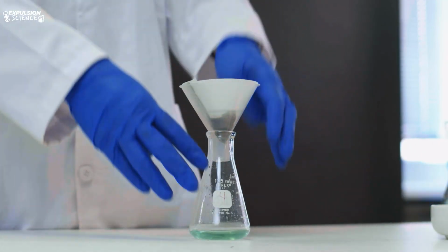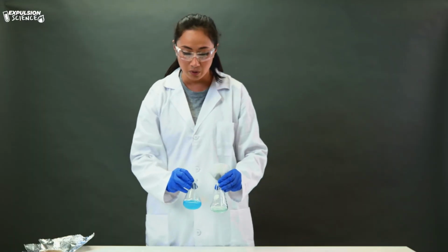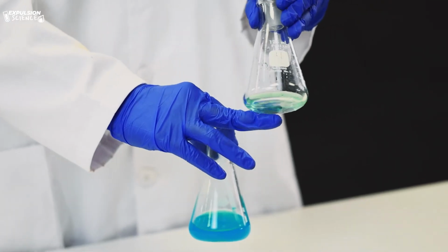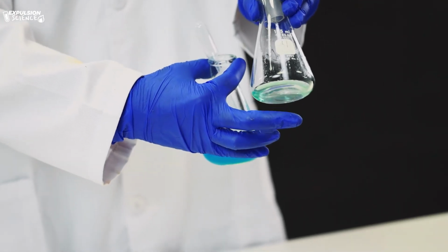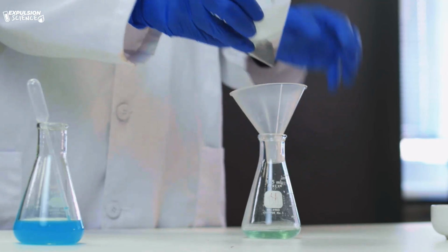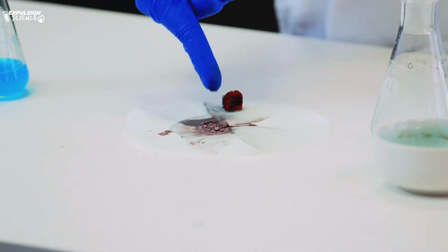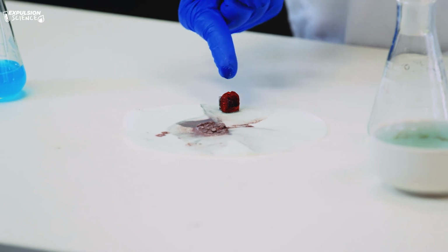I'm gonna set this back down, set this to the side, and let's take a look at what's happened here with our filtration setup. So notice how you've got greenish clear looking liquid. Let's compare it to what we had before. Now, what we're seeing here is the filtrate from the aluminum that has reacted with the copper 2 chloride. So this liquid in this flask is actually what we call aluminum chloride. Now, if I were to take this piece of filter paper off my funnel, now we've got some sort of powder here, and this is actually copper solid. This is what the copper would look like if we use aluminum foil, and then this is what the copper would look like if we use an aluminum block.